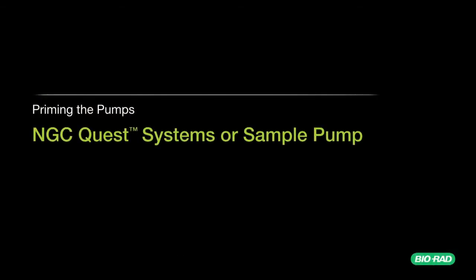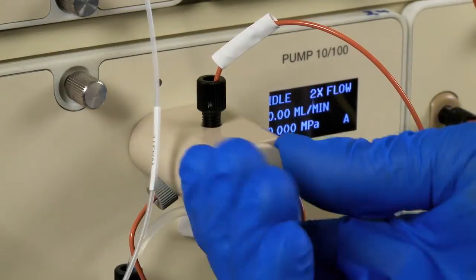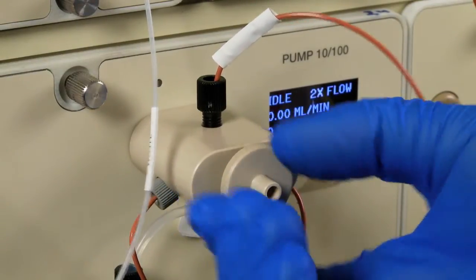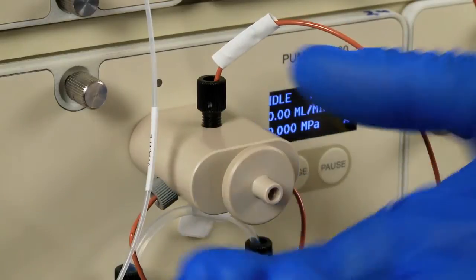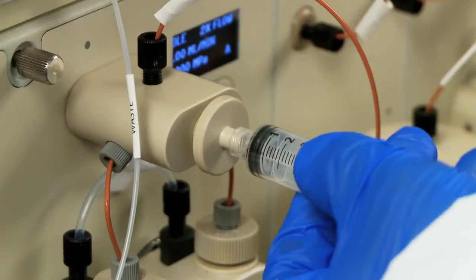NGC Quest systems or sample pump. Open the priming port by turning it counter-clockwise approximately one to two full turns. Then attach a syringe into the port.